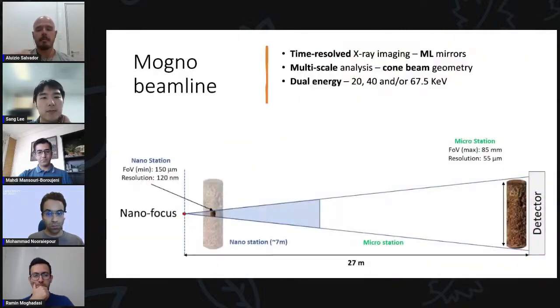Complementary to the measurements we're going to do in Carnaúba, we are also going to use the Mogno beamline. That's the one that Daphne showed the results of her work. The Mogno beamline is specifically dedicated to tomography, microtomography images, and it has very specific characteristics, mainly because it's cone beam geometry, that I show here in the picture.